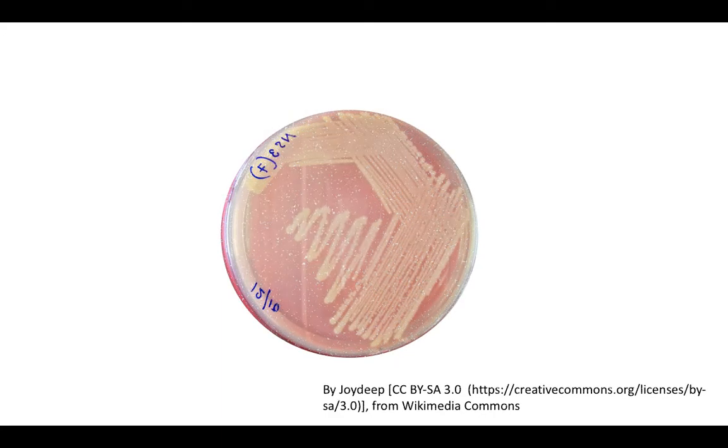to continue their streak. Then they have to wait until the next lab period to find out how successful they were. The bacteria need time to grow, so even if they have lab in a couple of days, their feedback on the procedure is separated from their actual performance of the procedure by a length of time. And they aren't necessarily going to remember the details of what they did to connect those details with their results. And then the plate isn't saved forever, so they lose the ability to look back at how their streak turned out.